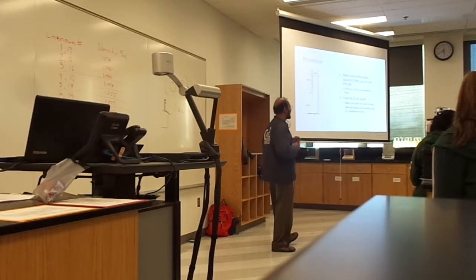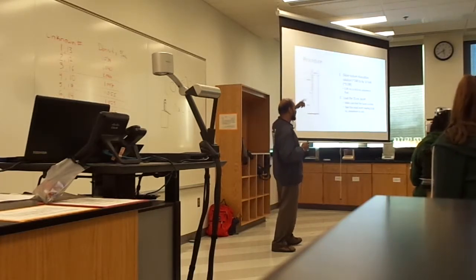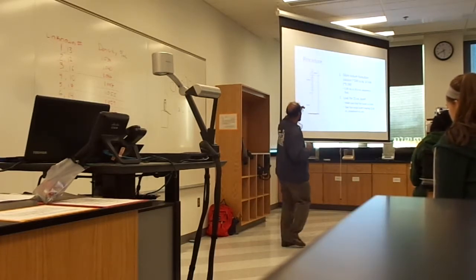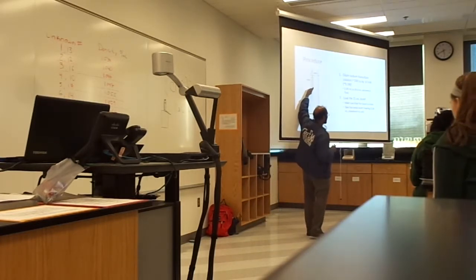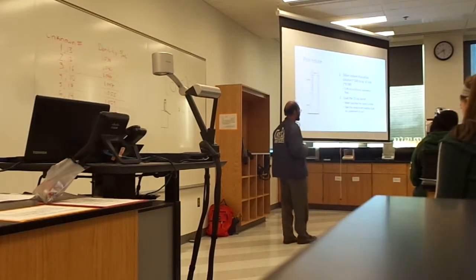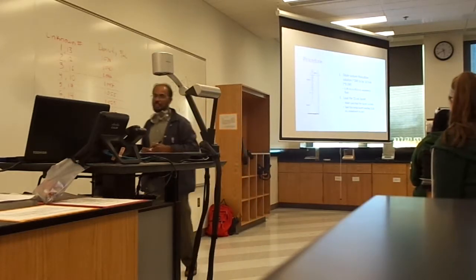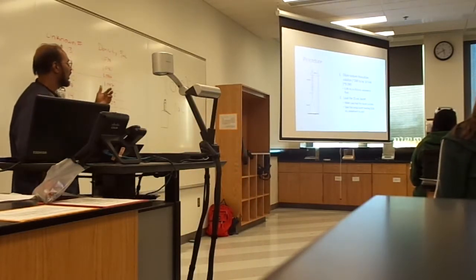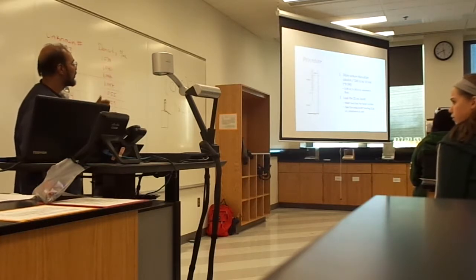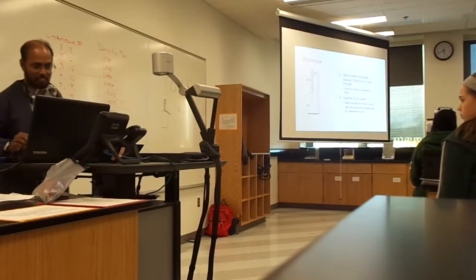I think it's easier to start from 0. Last time I noticed that some of you had difficulty reading the amount of titrant when you started somewhere in the middle, because sometimes you tend to use up more than the amount that's available. So it's probably better to start from 0 for every sample. Because this is only a 25 milliliter burette, so if you use up 20 milliliters in the first experiment, and in the next one you also need 20, it's better to start with 0.